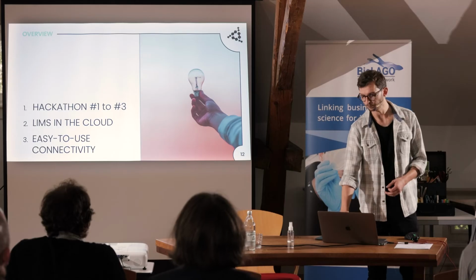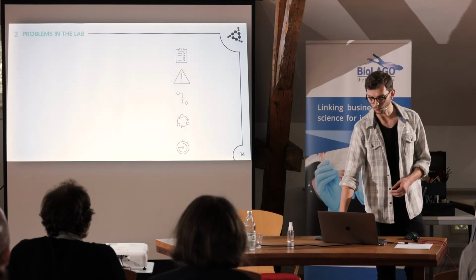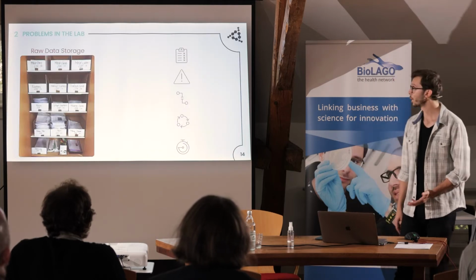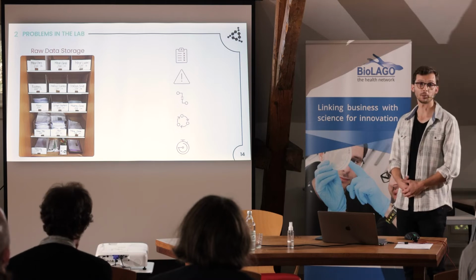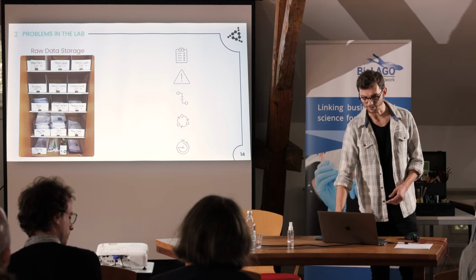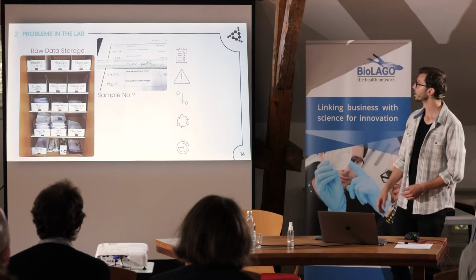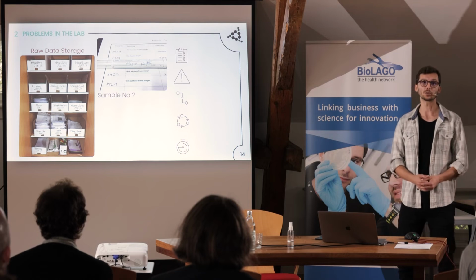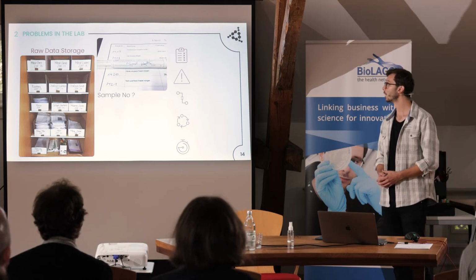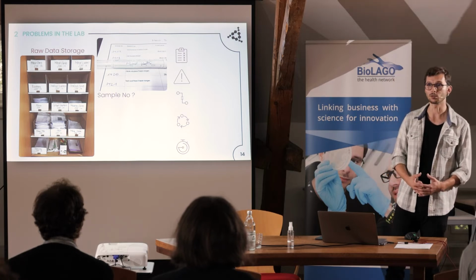So next step, I want to give a short introduction about LIMS and what we are doing. We're facing problems in the laboratory every day. The most common problem, as I mentioned before, is paperwork. Analog data acquisition is a very common form of storage. Then sample management, as we heard before: with handwritten samples in different kinds of medical labs, it is very important that you can read everything that they write.